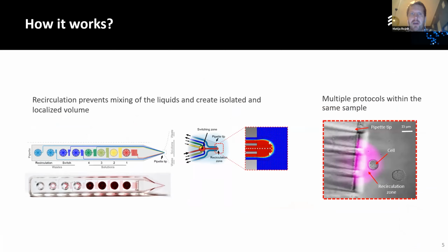Biopen works. So here we have a mathematical model of that imaging of that bubble. As mentioned, the Biopen has 3 channels at the end. It has a middle channel from which the solution is pushed out, and the 2 channels next to it are vacuum channels that are absorbing the solution back into the system. And this creates a microenvironment with basically no dissolution into the surrounding areas.